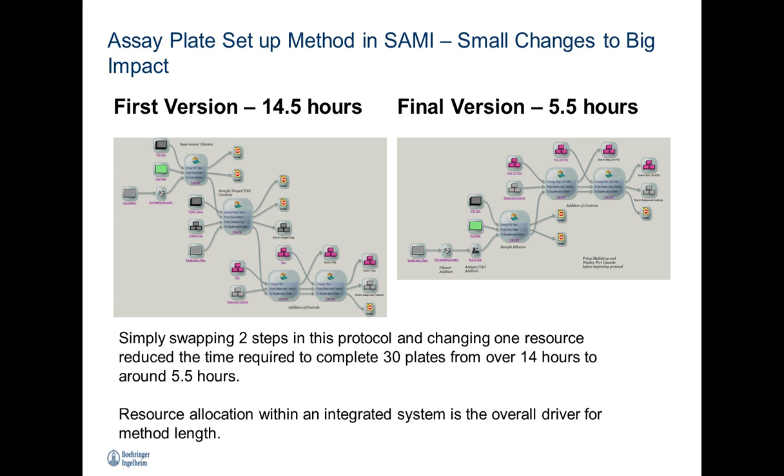Back to something that I mentioned in one of the earlier slides, small changes leading to big impact. When I was doing the initial method development for this MSD screening assay, I took the step-by-step approach that I used at the bench, and I put it into SAMI as I was doing it manually. The result was that a standard 30-plate screen would take over 14.5 hours, which was not viable for what we're doing.